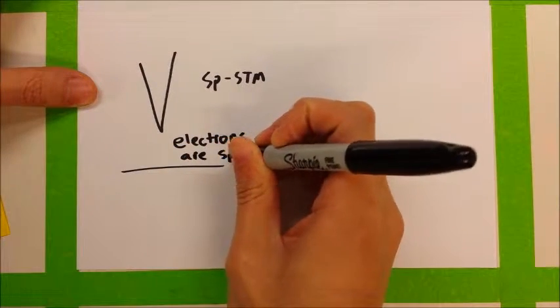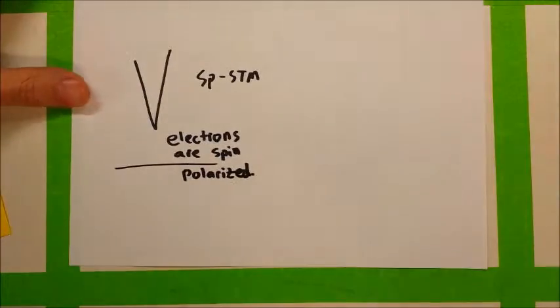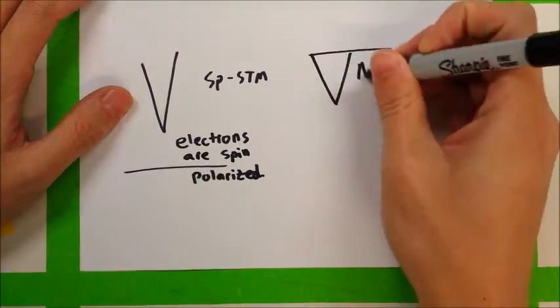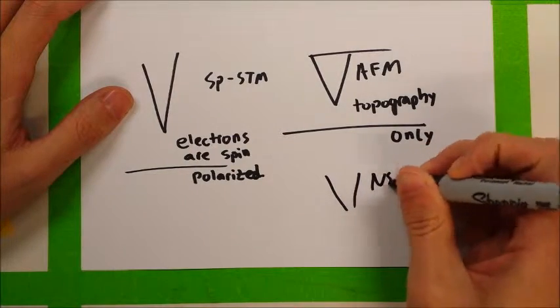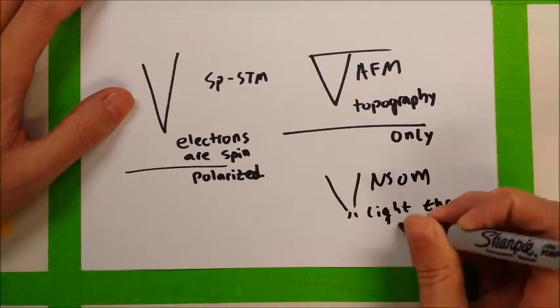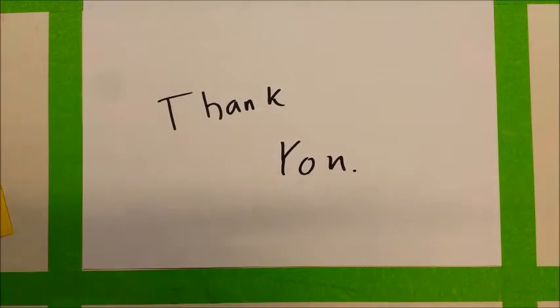As I mentioned, the method has spun off a whole field called scanning probe microscopy. From variations of the STM, like spin-polarized STM, to the easier-to-use but lower resolution AFM, its own spin-offs, and a variety of other techniques. The invention of STM was the starting block of locally resolved surface science, and very justifiably won the Nobel Prize in Physics in 1986. On a personal note, I love the fact that I can say that my research lets me look at atoms.